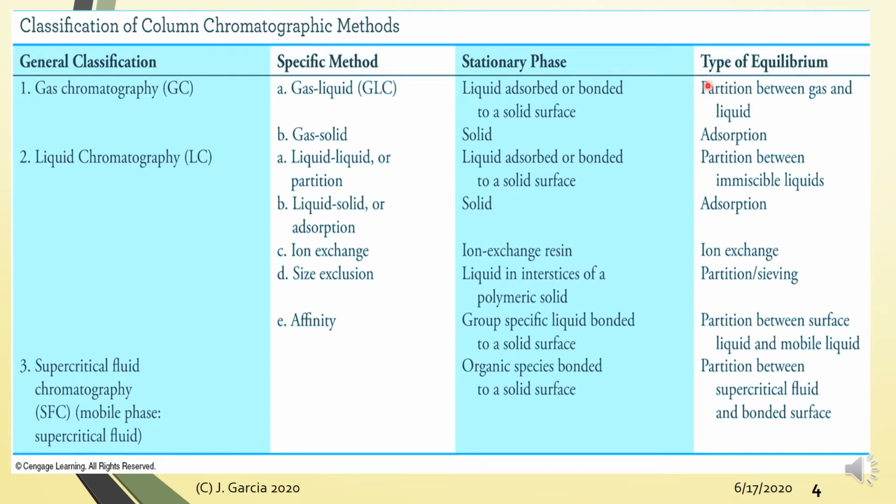Pag partitioning kasi, partitioning is related to solvent solubility. Alright? Solvent solubility. So, since liquid yung stationary phase mo, what you have there is partitioning. Okay? Kasi nagdi-dissolve, quote-unquote, yung analyte mo into the liquid phase. Next, you have your liquid chromatography.